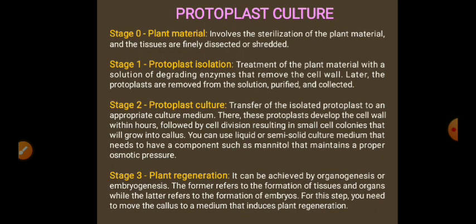The second one is protoplast culture. Generally the protoplast culture has 4 steps. First one is selection of the plant material: which plant, which segments we choose is more appropriate to get enough quantity of protoplast. After selecting the plant material, we need to surface sterilize it using 70% ethanol to avoid contaminants. Then later we go for protoplast isolation by means of chemical, mechanical or enzymatic methods.